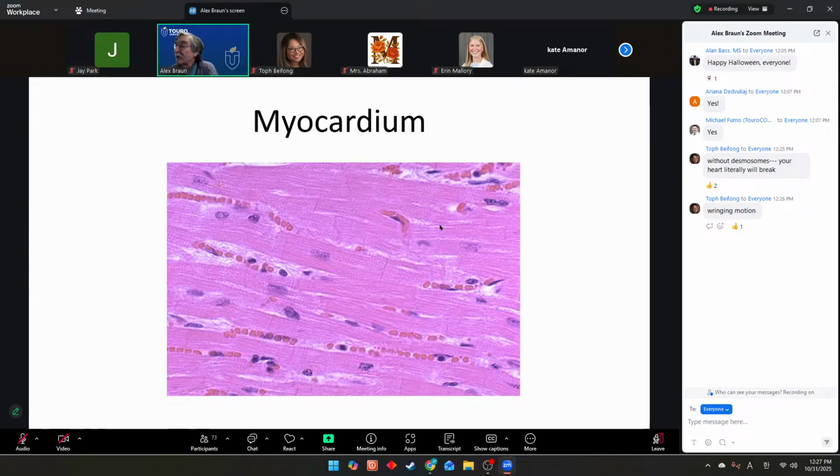And there are some other places where I think I could identify a similar phenomenon, but it often is quite subtle, but you could convince yourself if you train your eye to see that. In any case, in this particular picture, I'm not too worried about it. I think I pretty much know it's cardiac muscle because I see these well-defined intercalated discs and I see central nuclei, so I'm not so worried about identifying branch points, but it is good to be able to see them.